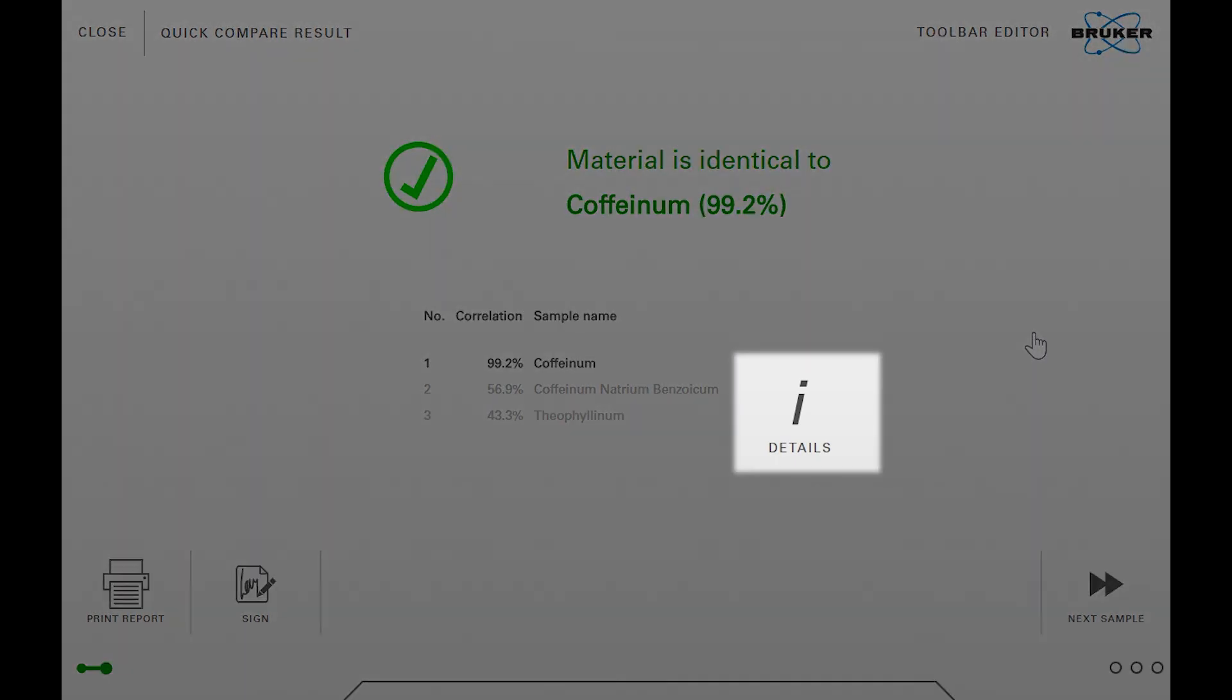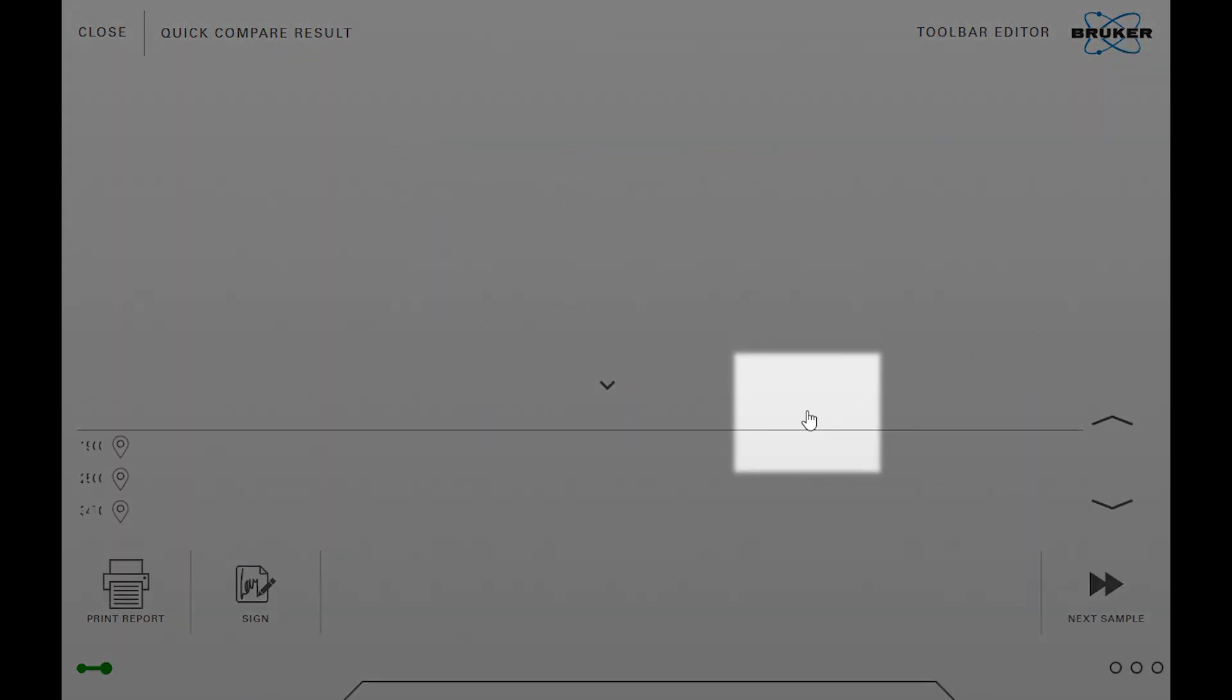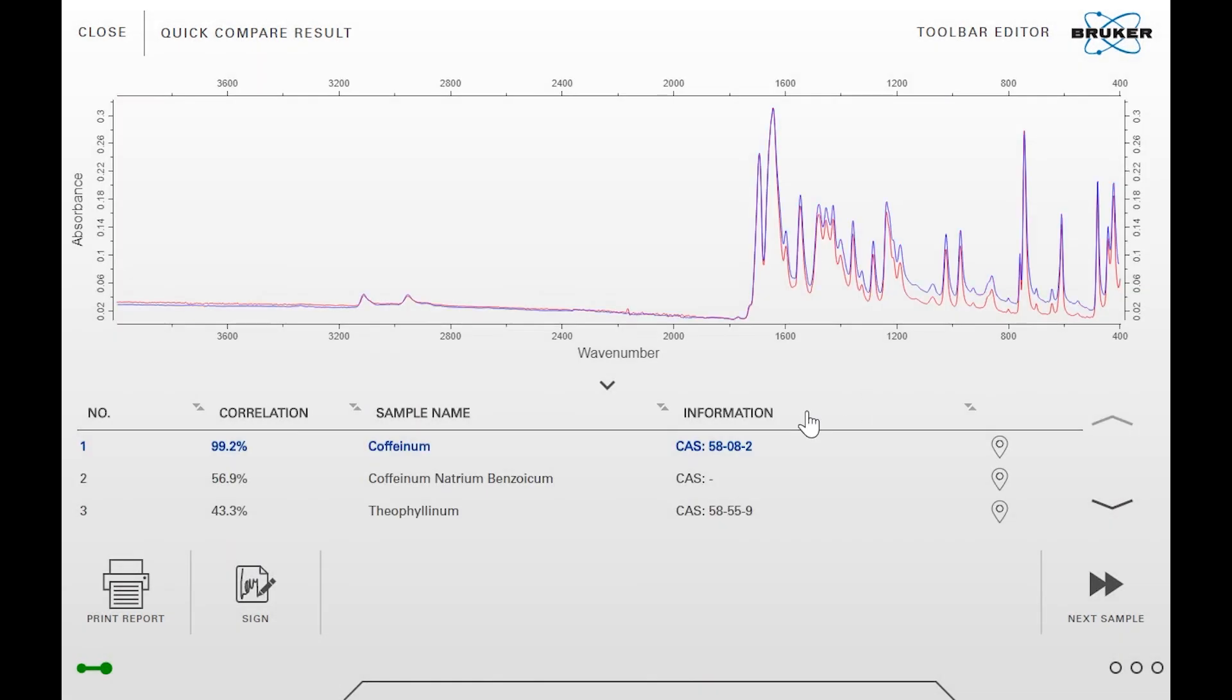You can click on the details button to see the relevant spectra. Finally, click on print report in order to create a comprehensive report or on next sample to measure the next sample.